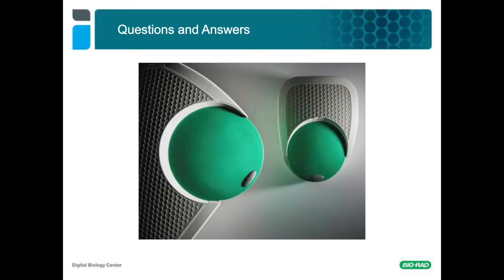So going back to measuring linkage, here's another question regarding that. Can you successfully measure linkage between more distant loci by merging wells together and performing meta-well analysis? Yes, you can.